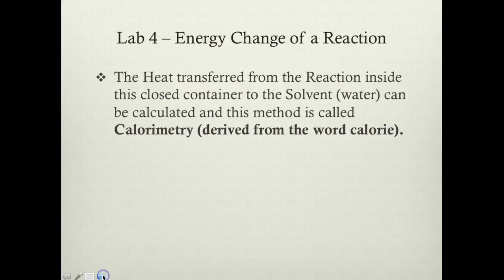So the heat transferred from the reaction in this closed container is transferred into the solvent. And what you will then do is have a thermometer dipped into the solvent or water. And so then you can note the heat being released as a temperature change, right? So this method of measuring the heat generated from a reaction is called calorimetry, all right?